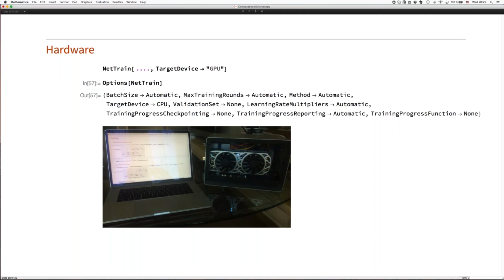Now, on a Mac, for example, this wouldn't go very far, because what you need for GPU support on a Mac is a CUDA capable device. So essentially you need an NVIDIA graphics card, and since 2 weeks now, I have a kind of local solution.